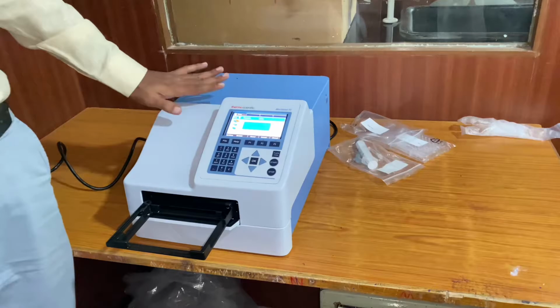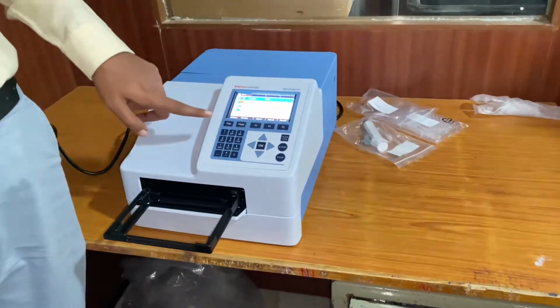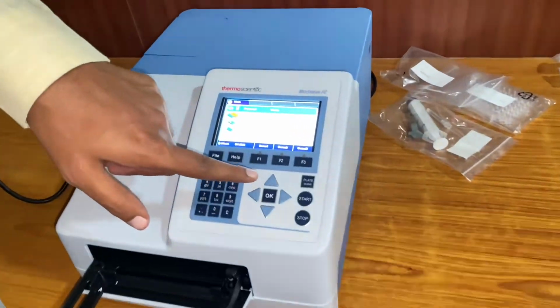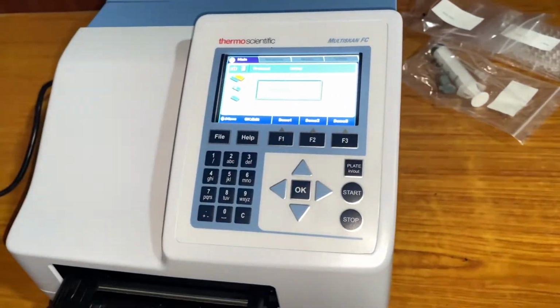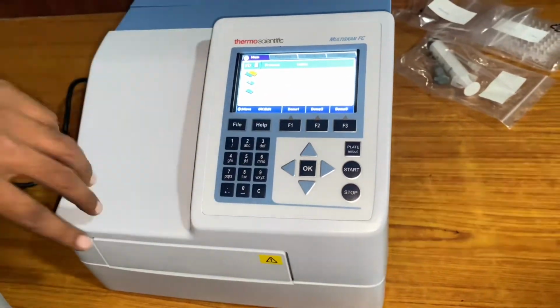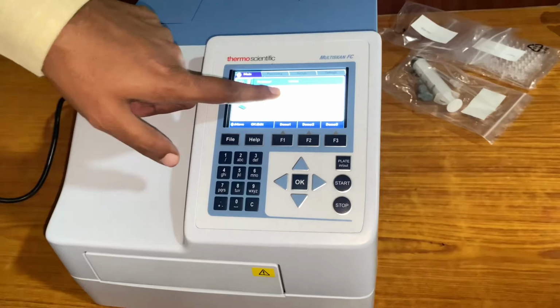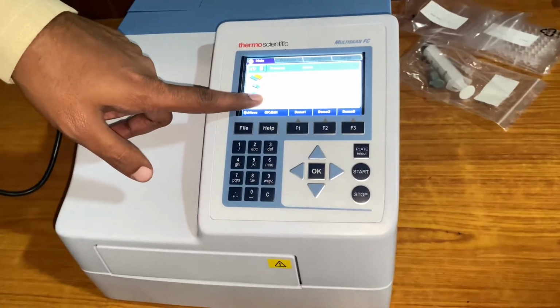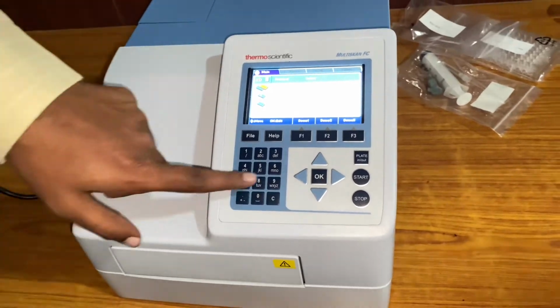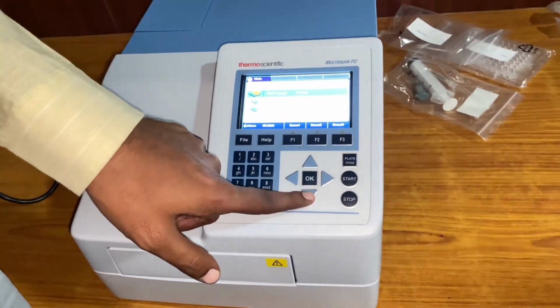Okay, once you start the instrument, this is the main screen. Here you can see plate in, plate out, so the plate will go inside. Here we can see protocol, plate formats, measurement. There is one option for shaking. It is just like a keypad, you just have to go to whichever it is.